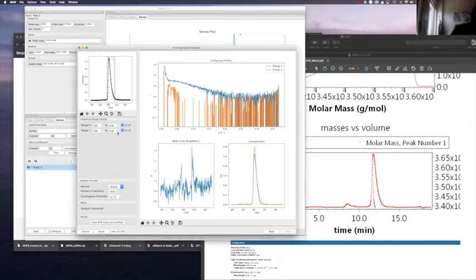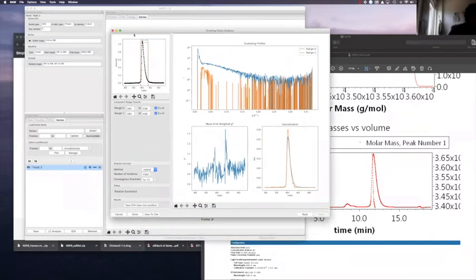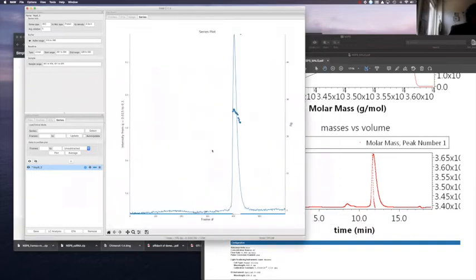I know that this is frustrating, but it's not working for all cases. So you need to be careful when you're applying EFA. But there is good news here. So we say cancel this.